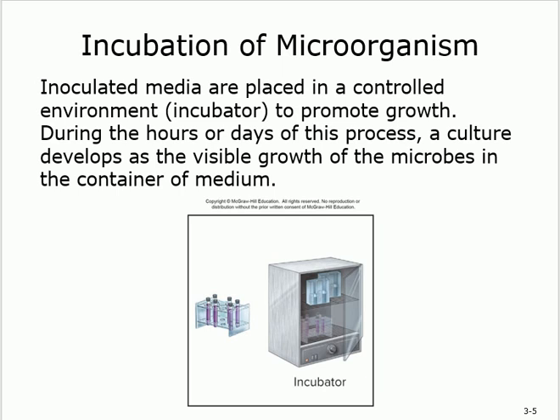And then we look at the changes. It was clear purple, for example. Now it's getting a little bit cloudy and a little bit solid, and you see patches or something. So these are visible growth changes. These are changes that you can see, and you say, okay, I'm done now.